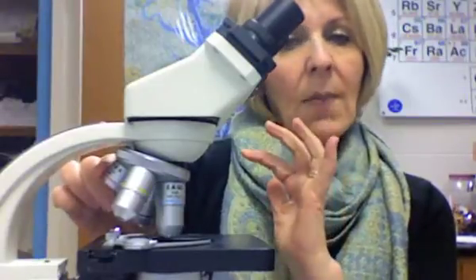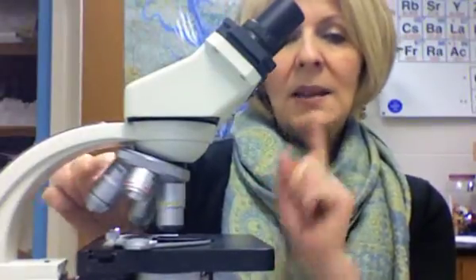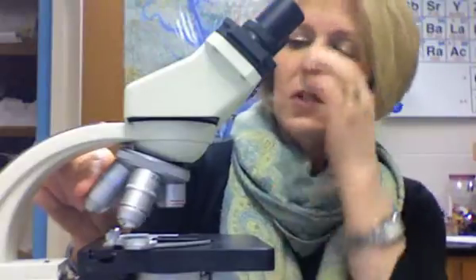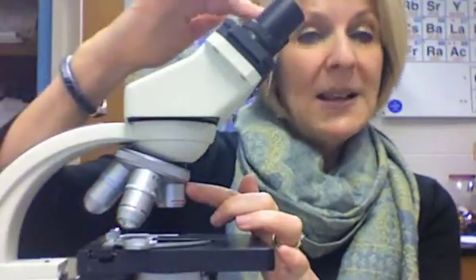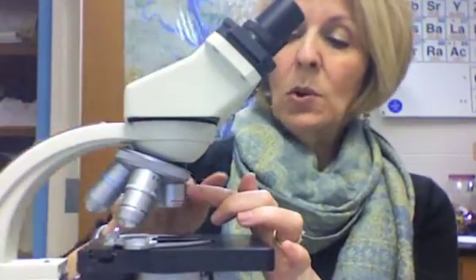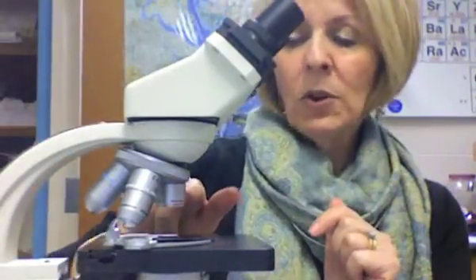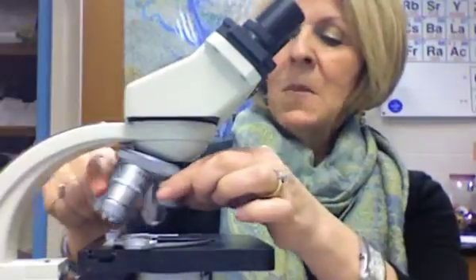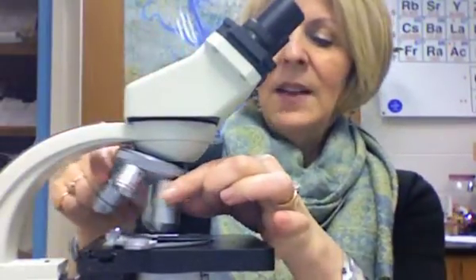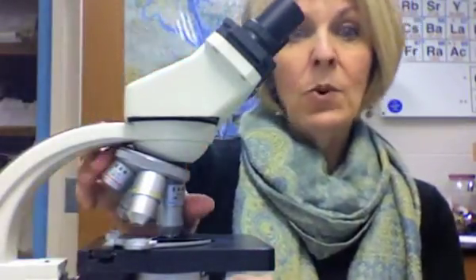That 100X objective usually has a white band — that's the oil immersion lens. You need special oil to make that work, so we're not going to use that today. The shortest objective is usually a 4X objective, and the eyepiece itself is 10X, so at low power that's 40X total magnification. The medium power is 10X times 10, giving 100X, and the high power objective is 40X times 10, giving 400X magnification.